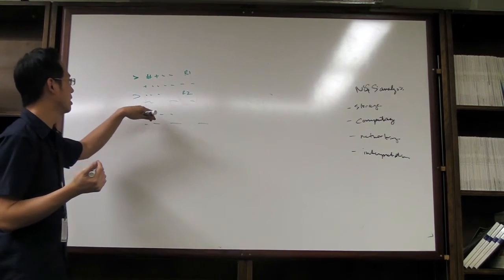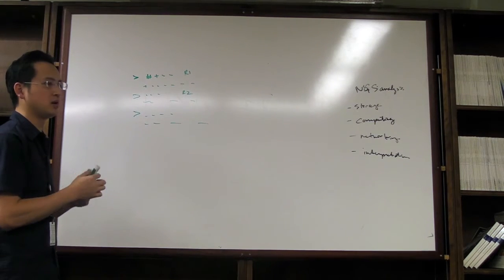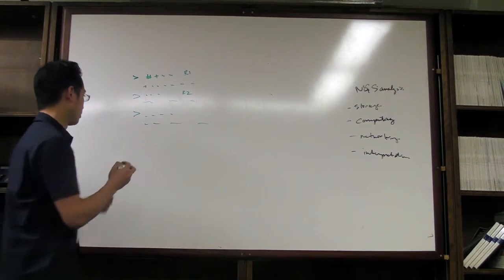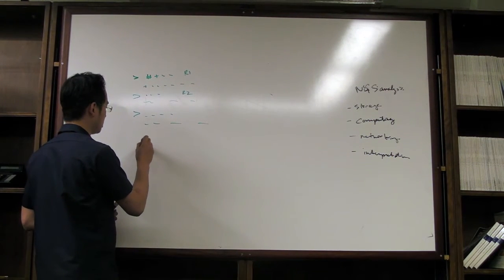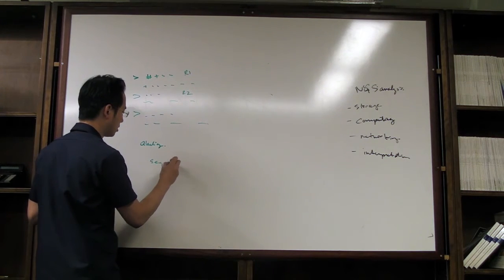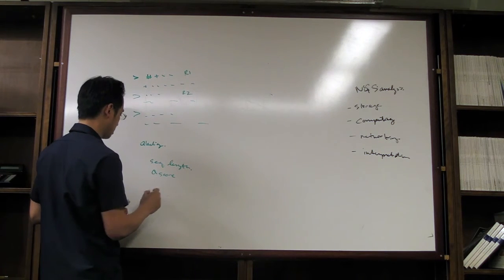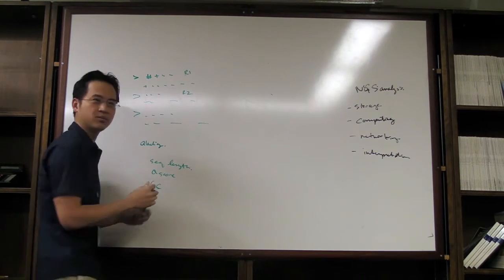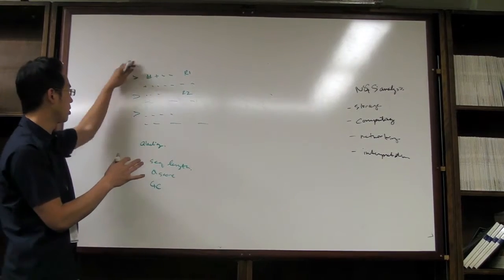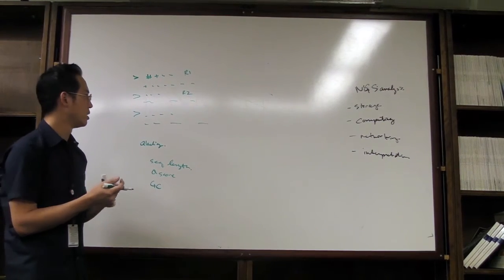So the very first thing, well, you need to map it, right, back to a reference genome. But before you can do that, you want to do several metrics and quality checks. First thing you can do is a quality check in terms of how long are my sequences, the quality score, the GC distribution of my sequencing to make sure there's no bias. All these metrics you can basically run this file through very quickly, and you get an overall sense of how good your sequencing was.